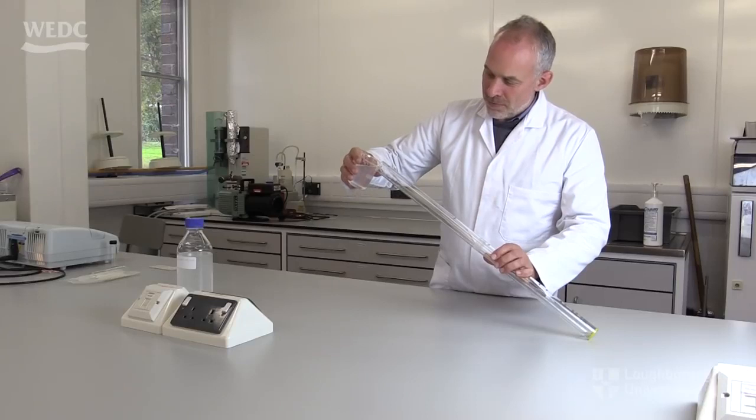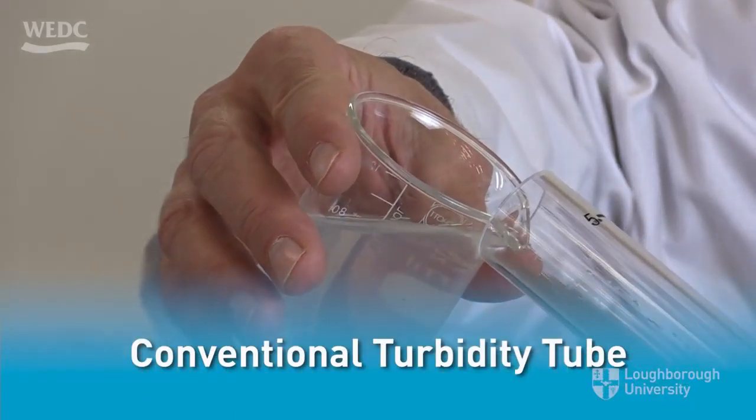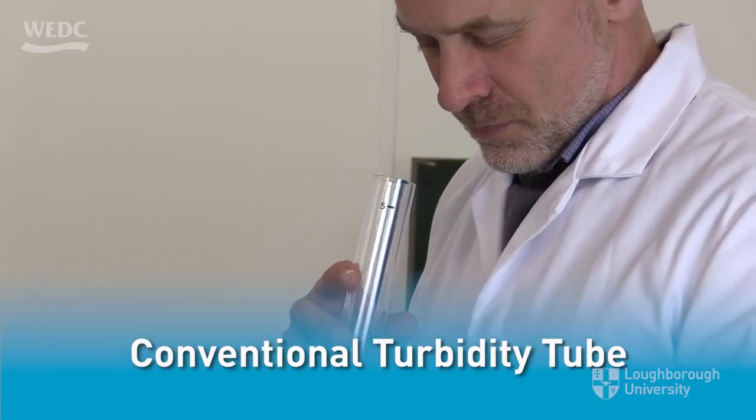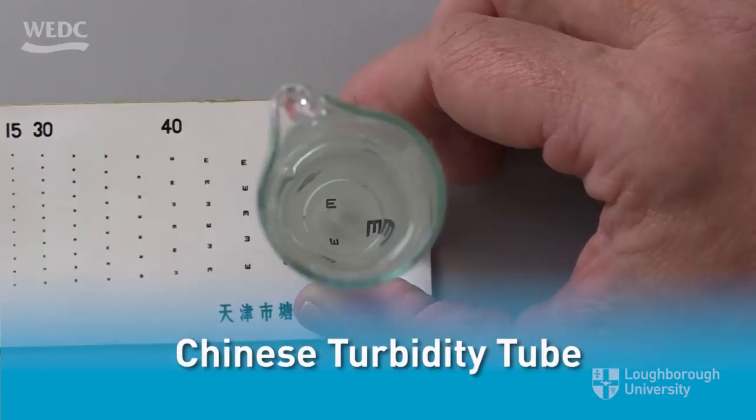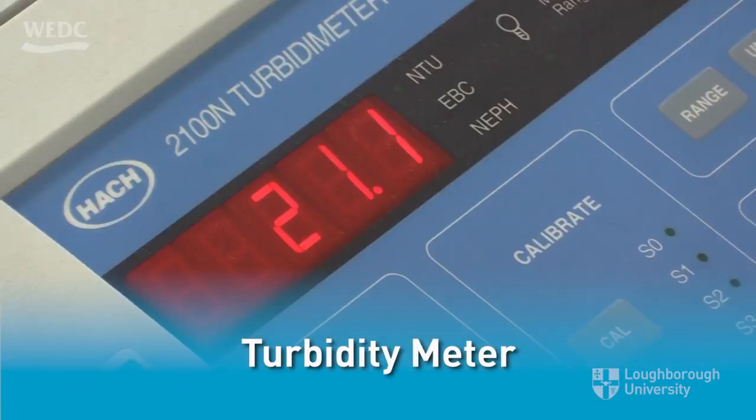In this film, we look at three methods of measuring turbidity in the field: measuring turbidity with a turbidity tube, the Chinese method, and measuring turbidity using a turbidity meter. The first two methods are simple means of measurement.